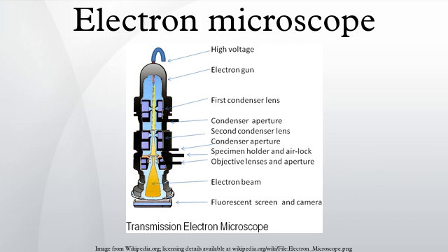Negative stain. Suspensions containing nanoparticles or fine biological material are briefly mixed with a dilute solution of an electron-opaque solution such as ammonium molybdate, uranyl acetate, or phosphotungstic acid. This mixture is applied to a suitably coated EM grid, blotted, then allowed to dry. Viewing of this preparation in the TEM should be carried out without delay for best results.